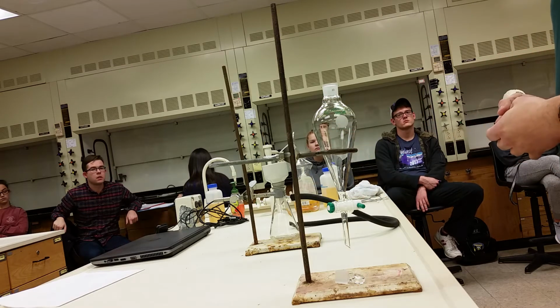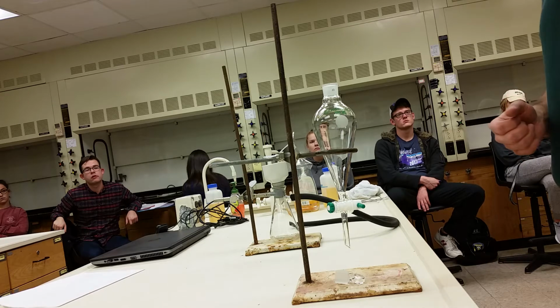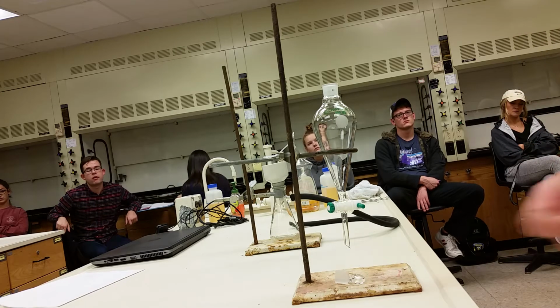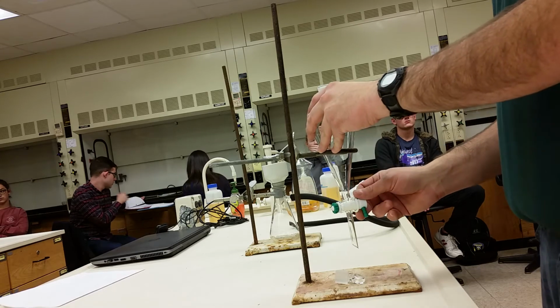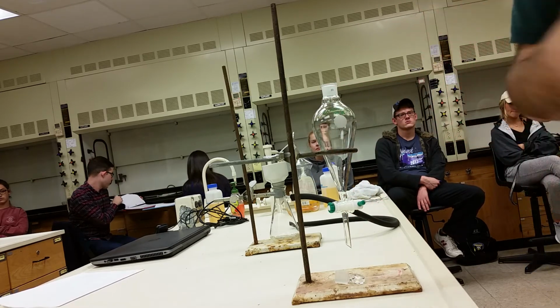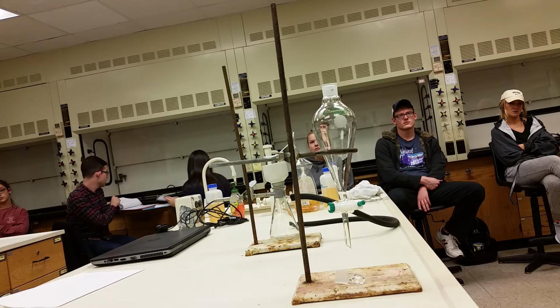Once the layers separate, because you're using this bicarbonate, you're going to take the 125 milliliter Erlenmeyer flask that you've labeled bicarbonate, put that underneath here, and open up the stopcock to drain out the bottom layer. The bottom layer is going to be the bicarbonate layer. The top layer is the ethyl acetate. That still has your compounds dissolved in it.